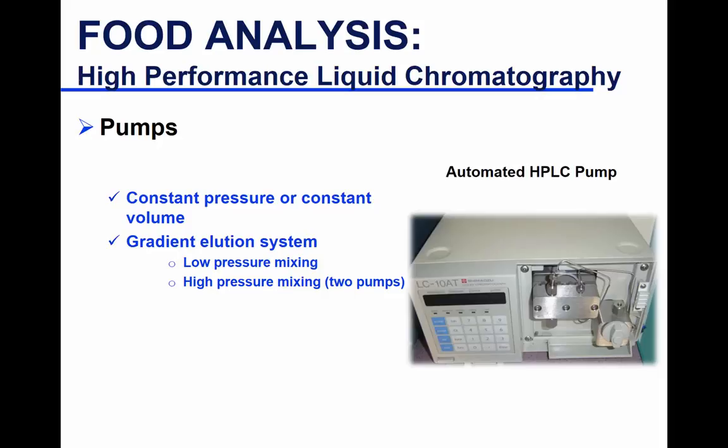I already talked about low pressure mixing or high pressure mixing. With low pressure mixing, you have a mixer unit before the pump, so the solvents mix before they get into the pump, or you have two pumps and mixing happens after the two pumps.